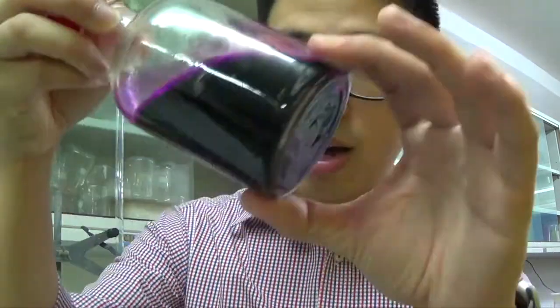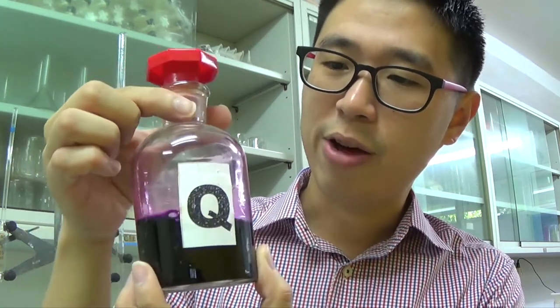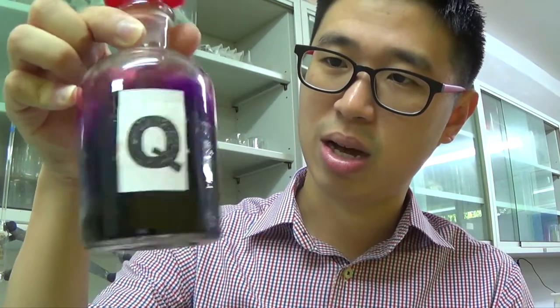This is acidified KMnO4. You obviously can't see the acid because the acid is colorless, but KMnO4 consists of the transition metal manganese in the plus 7 oxidation state. That's why it's called manganese 7. VII refers to 7, 5 plus 2 for the Roman numeral. So it's very dark purple in color. You will have used these a lot of times. You have seen it a lot of times as well.